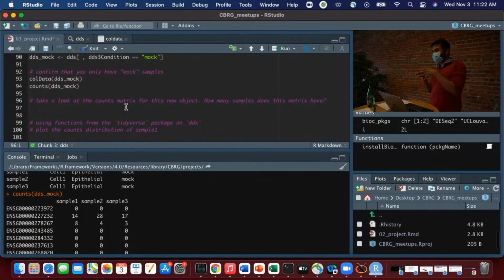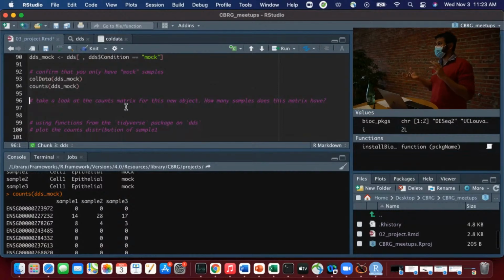Whereas here, if I say I don't want sample 5, I can just remove it from this S4 object and all information related to sample 5 disappears. So this is a very convenient and problem-free way of packaging this kind of complex omics data.